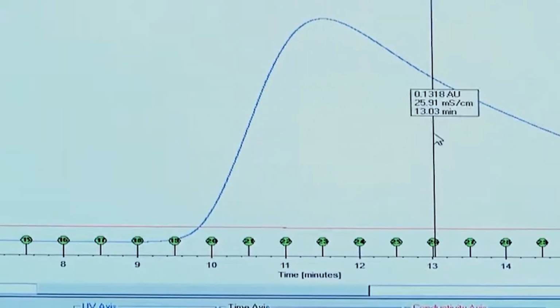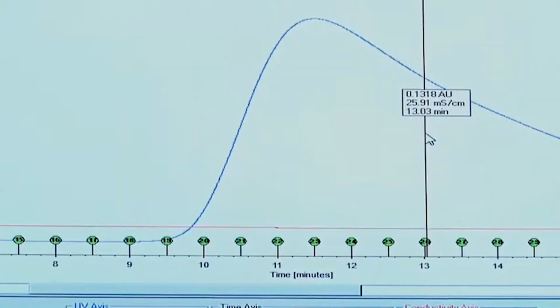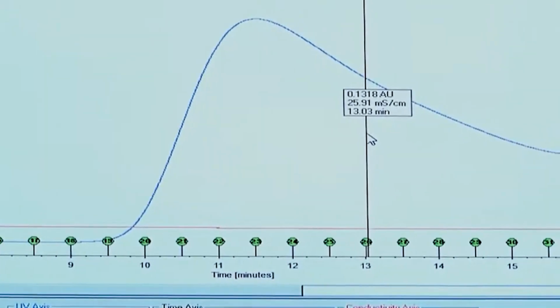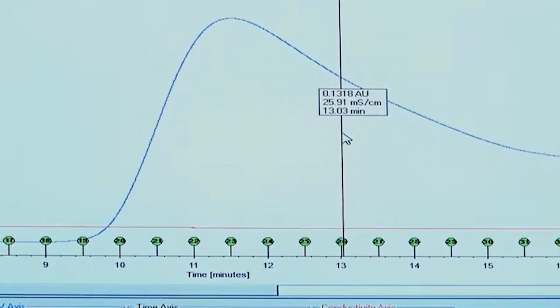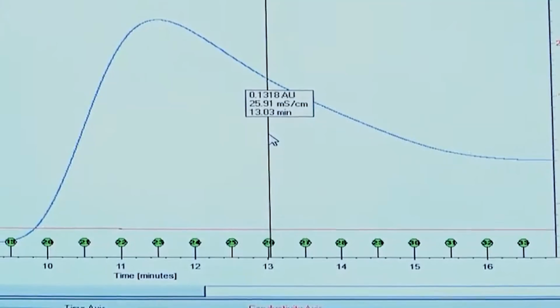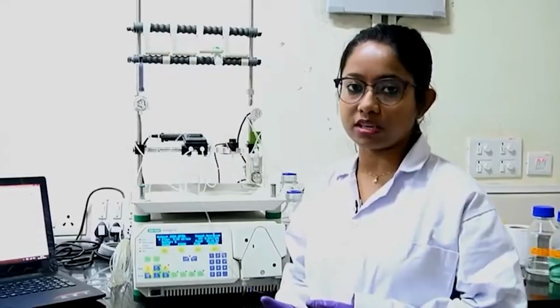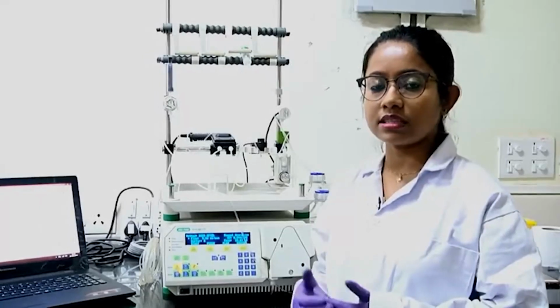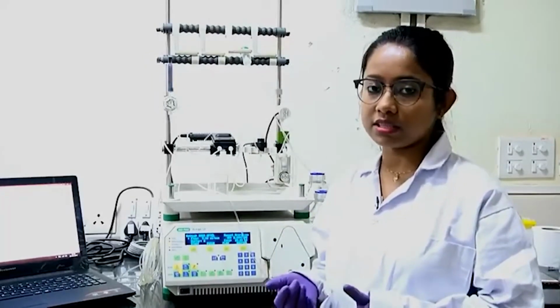I have isolated my protein from other contaminant proteins from the cell lysate or other mixture of proteins, and this protein has a 6x histidine tag. After I collect all the fractions, run the gel and confirm that my protein is present and pure, then I can go for cleaving of this his tag.